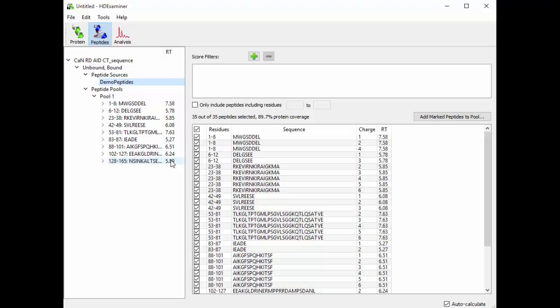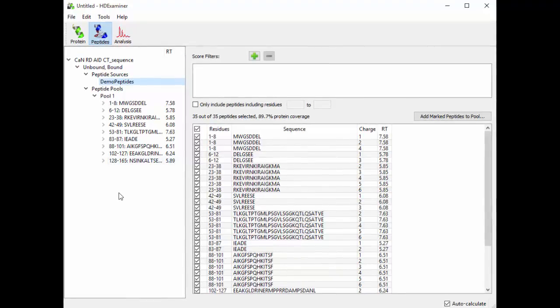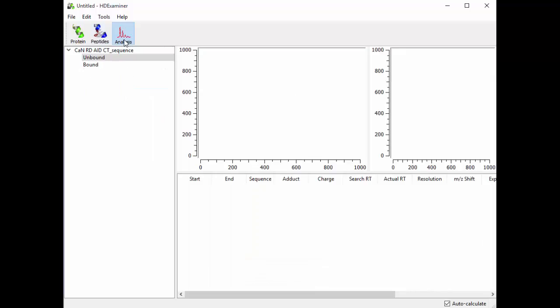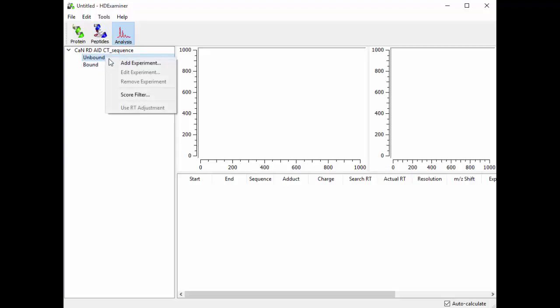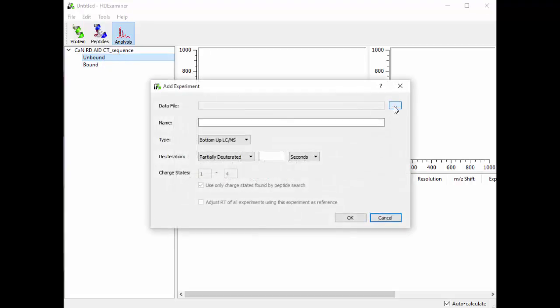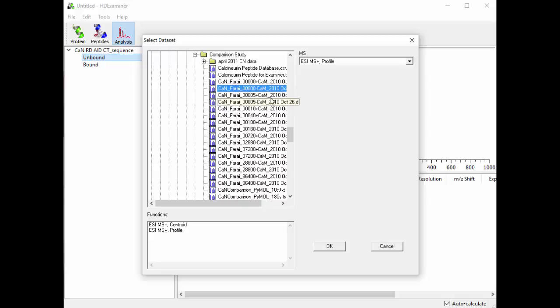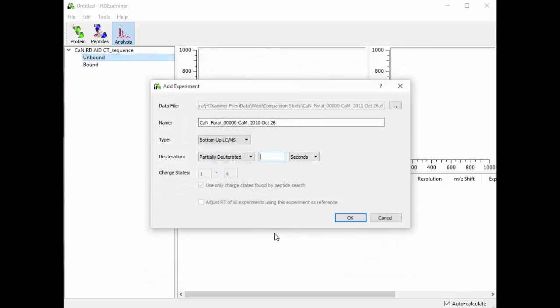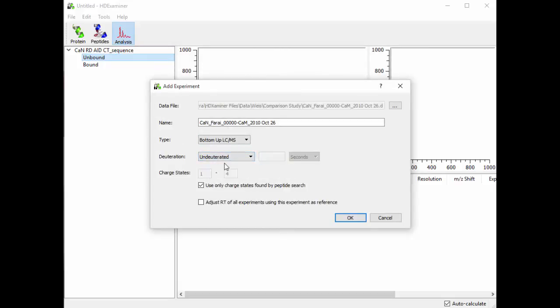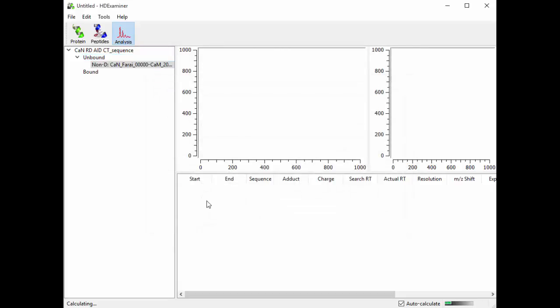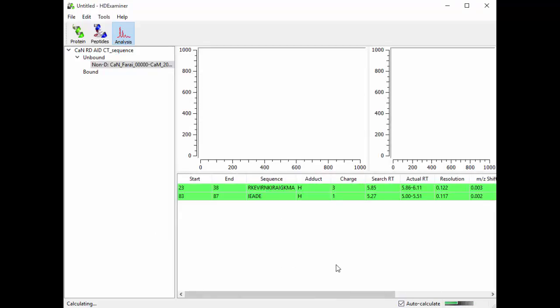So the next step is to go and find them. So to do that, we go over here to the Analysis view, and we start loading up MassSpec data files. You can see we have both of our protein states here, Unbound and Bound. So I'm going to right-click on Unbound and say Add Experiment. I'm going to click on this button here, and I'm going to select my Unbound Undeuterated MassSpec data file. HDExaminer requires Profile Mode MS data, so I'm going to select that. I'm going to tell HDExaminer that this is a bottom-up LC-MS experiment, and it is Undeuterated. I'm going to hit OK. And as soon as I do, you can see down here in the bottom that the calculations are already starting.